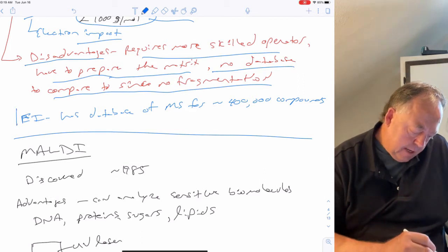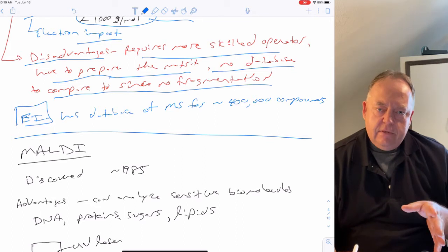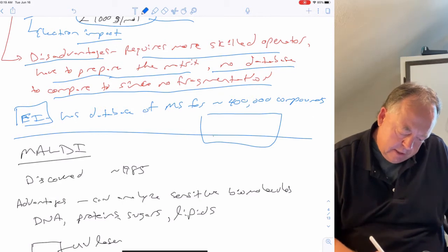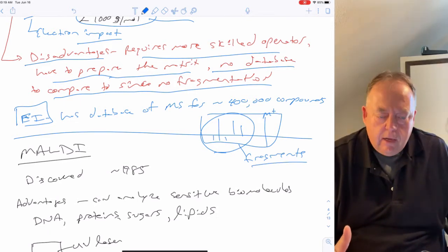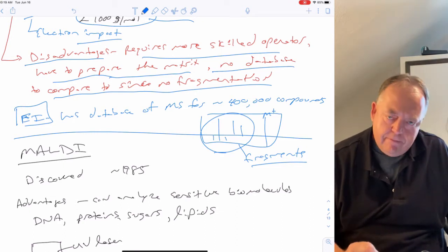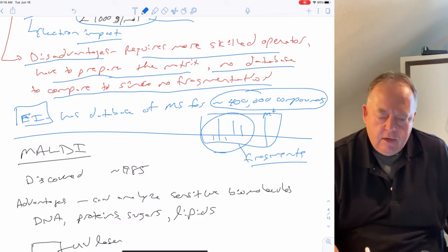Right? Whereas with electron impact, when the molecule breaks apart into smaller pieces, that's like a fingerprint of the molecule. If you do the electron impact using the exact same conditions, the molecule should fragment the same way. And so when you see these peaks for fragmentation, so if this is your molecular ion peak, and these are your fragments, that's like a fingerprint of the molecule. And so there are huge databases for molecules where their electron impact mass spec has been published. Right, so over 400,000 different compounds have their electron impact mass spec in a database.